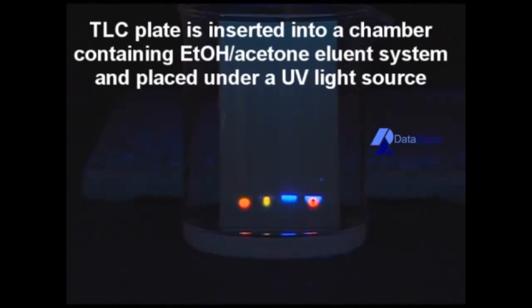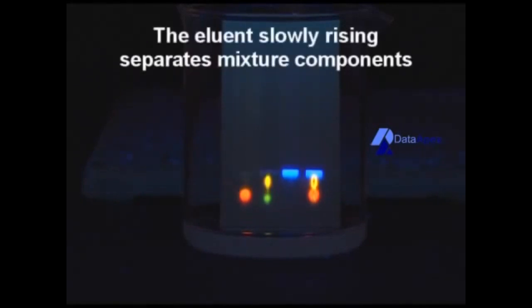We have the first spot on the right, a mixture of unknown components. The first three spots on the left are pure compounds.